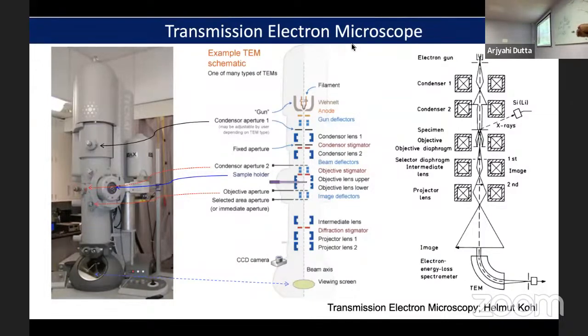Right? Why do we need this electron microscope? Why do we need to make this complicated? We can just use a simple light microscope and add more and more lenses. We'll make a microscope like a 3-story building. We'll just put lenses and then we'll magnify everything. And then at the end, if you have graphene, you can see all the carbon atoms if you just gradually magnify it.